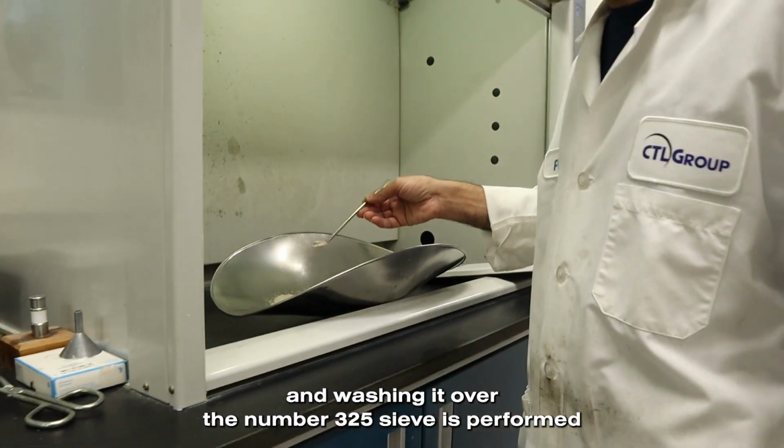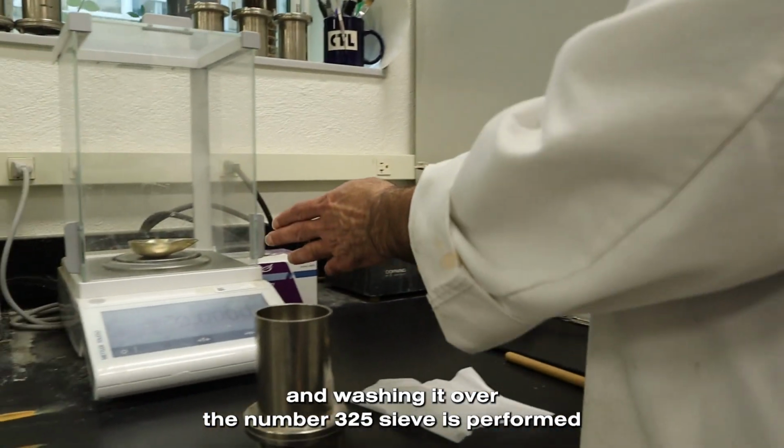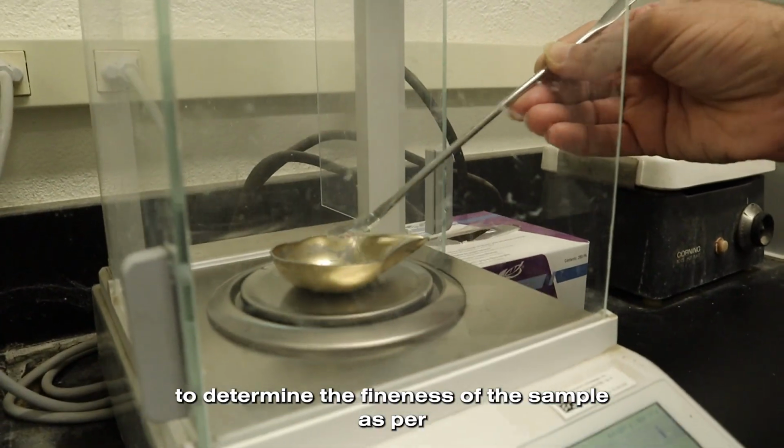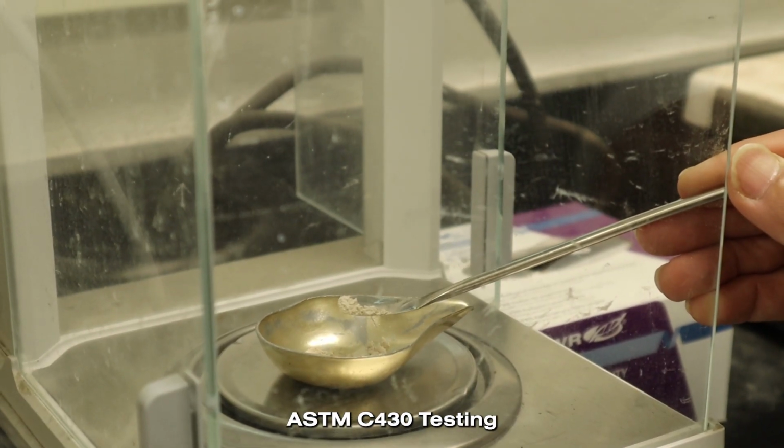Weighing of the ash sample and washing it over the number 325 sieve is performed to determine the fineness of the sample, as per ASTM C430 testing.